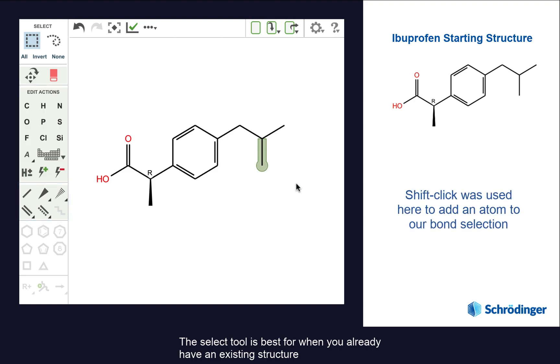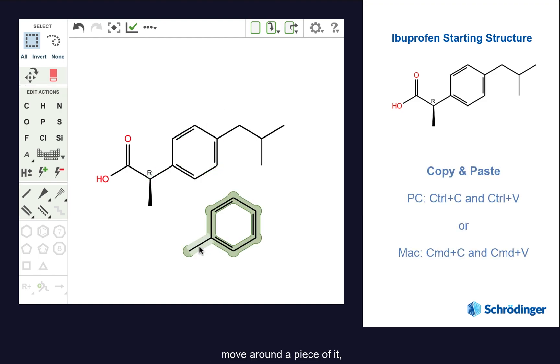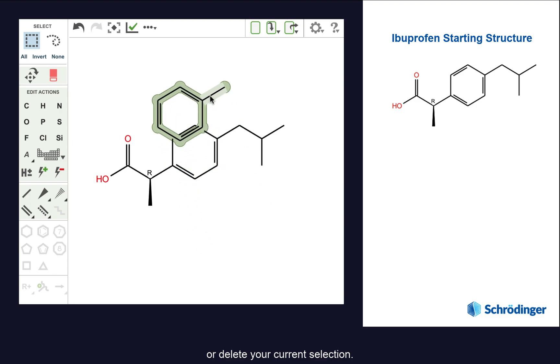The select tool is best for when you already have an existing structure and you want to copy and paste part of it, move around a piece of it, or delete your current selection.